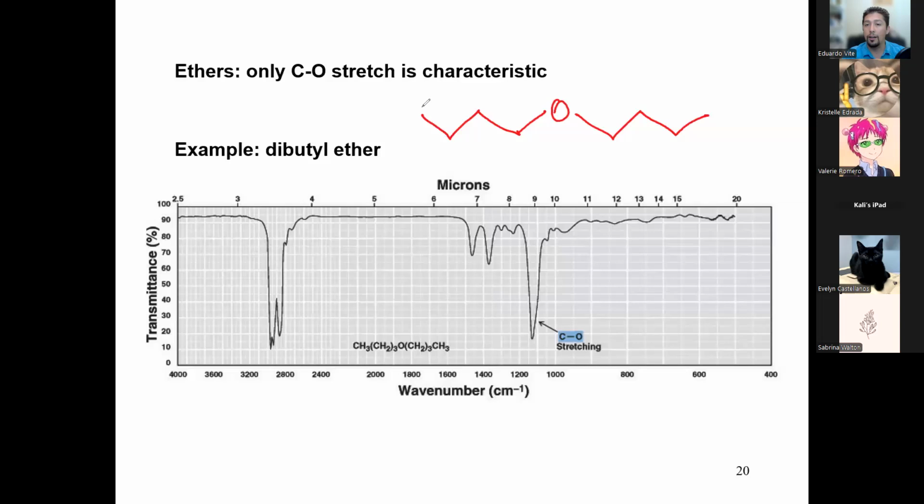There's only carbon and hydrogen and carbon and oxygens, nothing else. So the spectrum should look really clean. And sure enough, you don't see many peaks. So it's very easy to tell. So again, we start with the higher wave numbers. I'm going to use green. What are these? What are those signals right there? They're everywhere. All molecules have them.